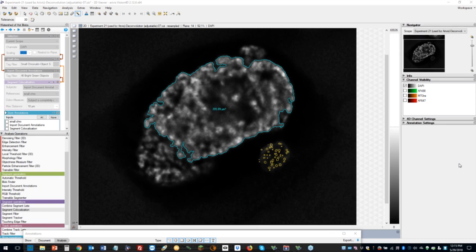I have no idea what it is, but there's some upper limit. It really exists. But in practice, I personally have worked with data sets as big as 12 terabytes. And I will say that the performance of the software was excellent, stable. I was able to do the things I needed to do with those images.